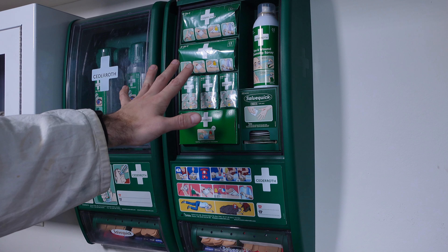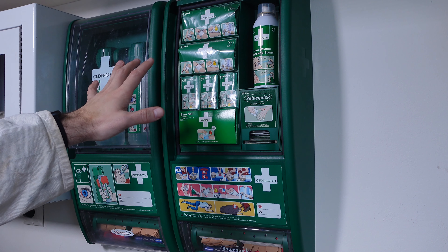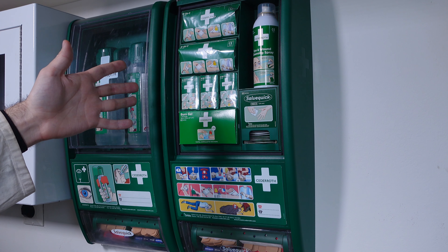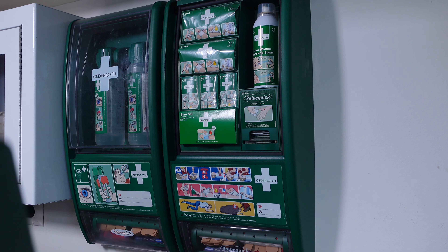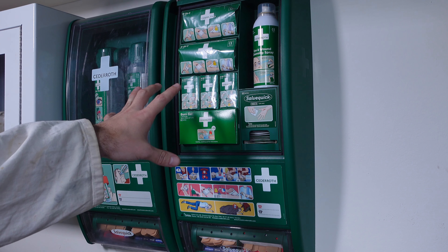Hello, today I would like to present something that I believe is one of the best and nicest layout first aid kits designed for a workplace and lab environment. I had the opportunity to take one of those home and I'm going to be replacing it with a new one with a good expiration date.